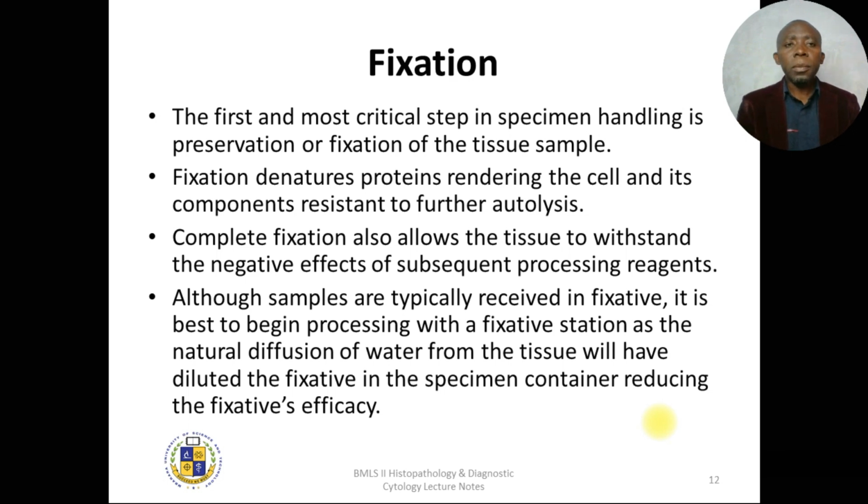Last time we discussed fixation, and I'm not going to spend much time on it, but I will refer you to my tutorial about fixation, where you can go into detail on the procedure. The main purpose of fixation is to prevent post-mortem changes such as autolysis and putrefaction, which may make us miss some of the elements significant in diagnosis.